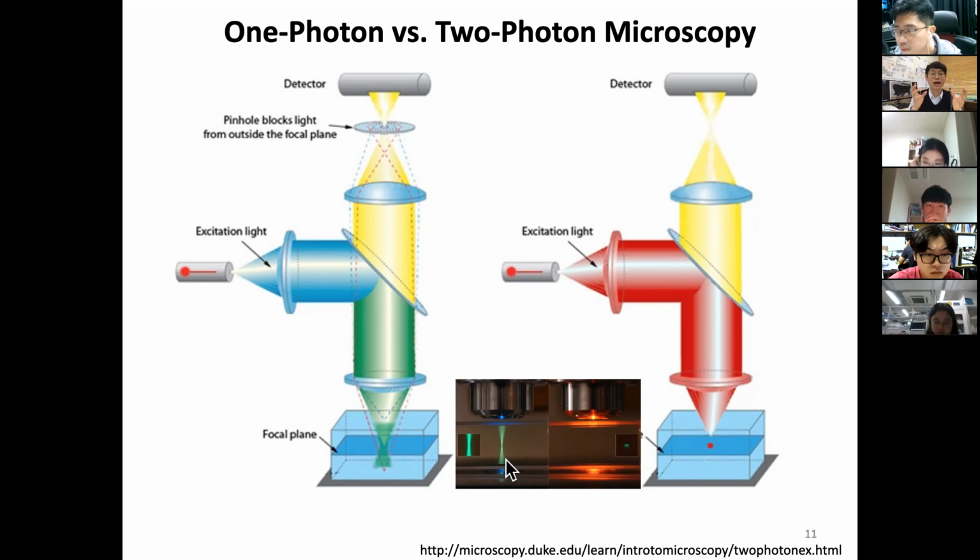Because the sample you have, once it is illuminated, it will photobleach. The sample will degrade, all right? So confocal is a trick to make this semi-3D while you actually shine everywhere. So if you are interested in time-lapse microscopy, to keep the cell alive for a long time, you have to expect some things can go wrong because you are shining all the time, while two-photon is not the case.